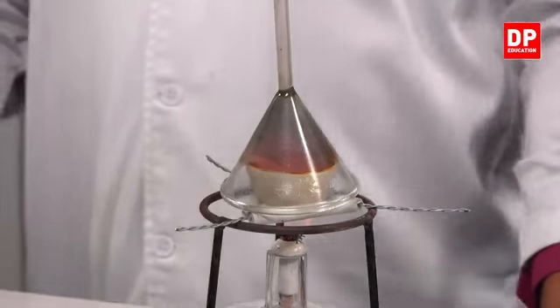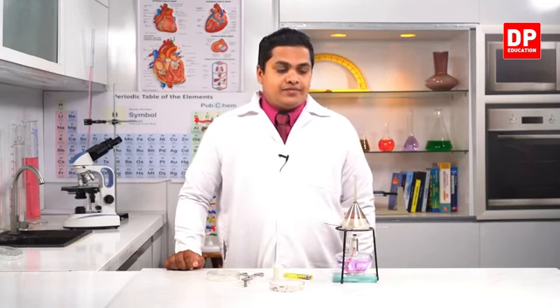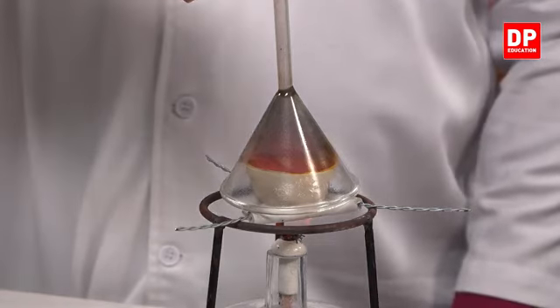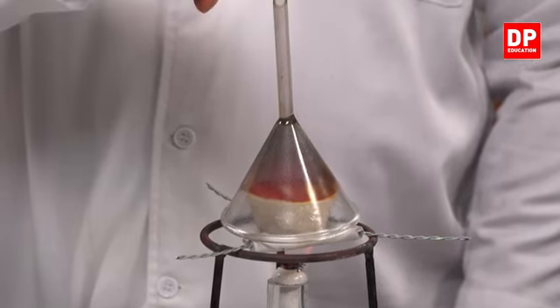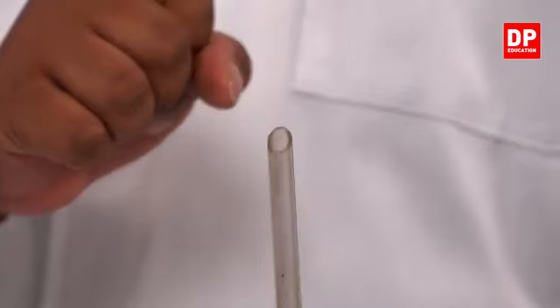So my dear children, you can see that here it's clear. Now iodine has not turned into a liquid. You can see that a purple color gas is going to be emitted. See, a purple color gas is being emitted from the system.